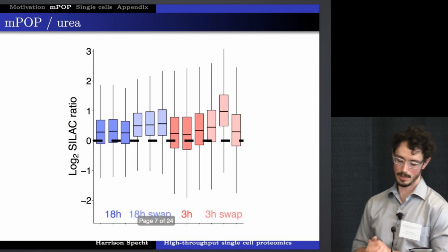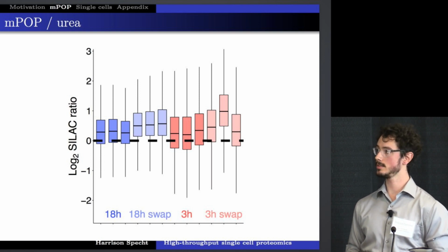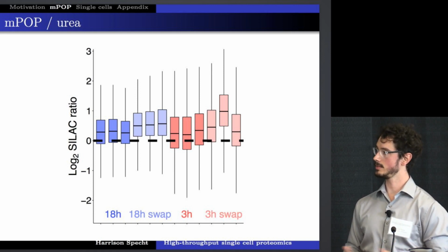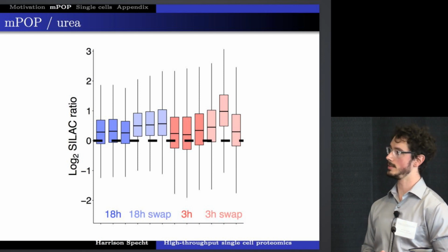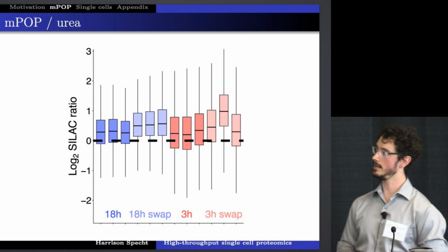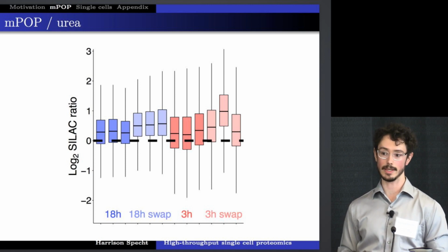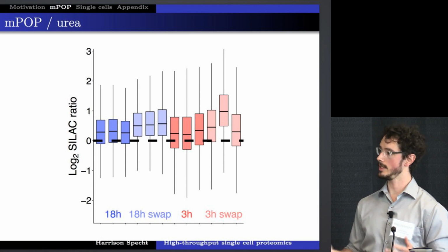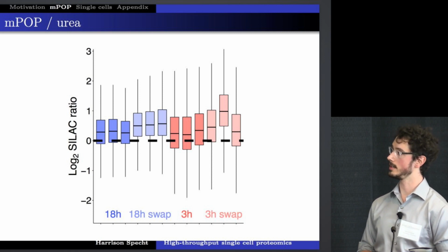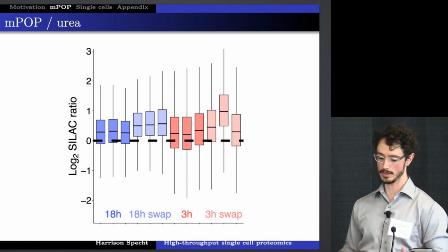Here we plot the distributions of the SILAC ratios across the whole proteomes under a number of different digestion conditions, and also performing label swaps of the SILAC under these 2 different growth medias and processings to control for any artifacts that may have been induced in one culture versus the other. Here we see that across the distribution of the whole proteome, we see a certain amount of variation, but we find that the mPOP samples, when put in the numerator, compare very favorably. Now, since this is on the log2 scale, should these distributions match very closely, namely the peptide ratios be 1 to 1, we would expect a ratio of 0 on this scale. We find that mPOP is doing at least as good as urea with respect to the cell lysis and protein extraction and digestion as well.